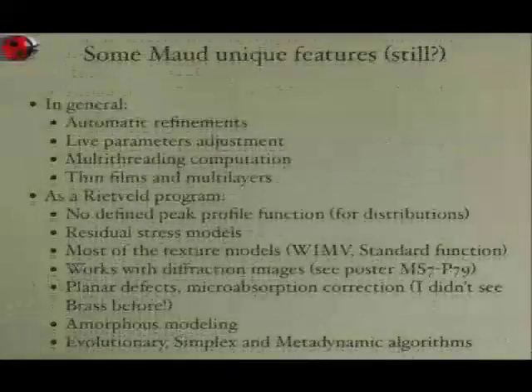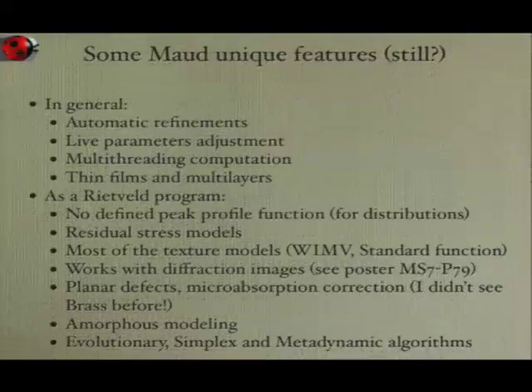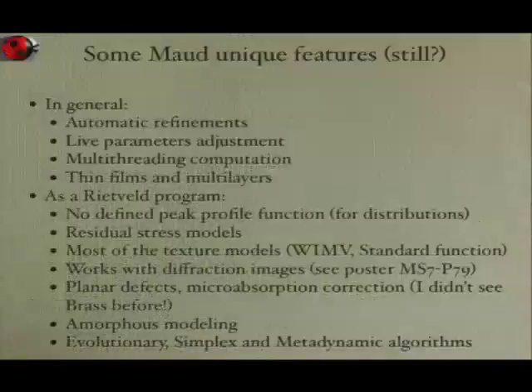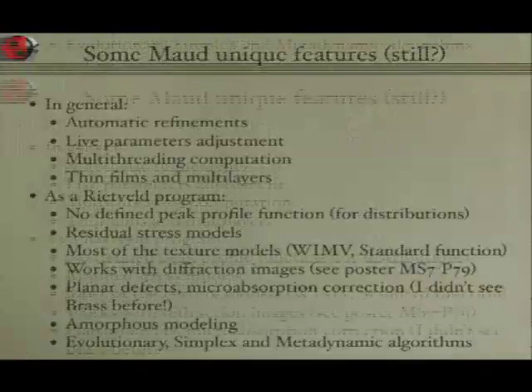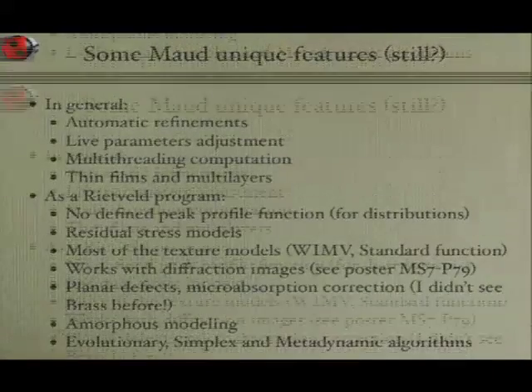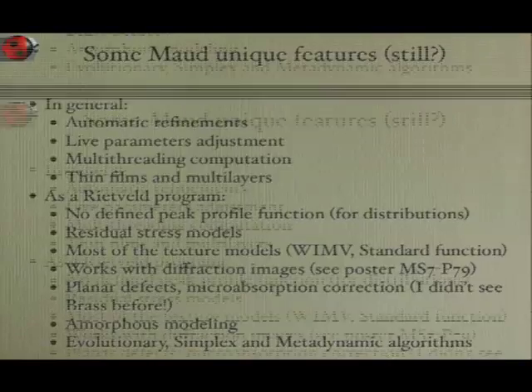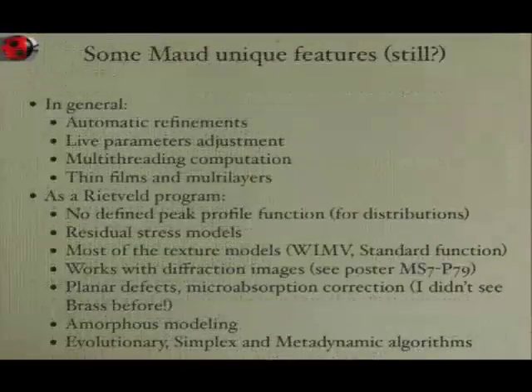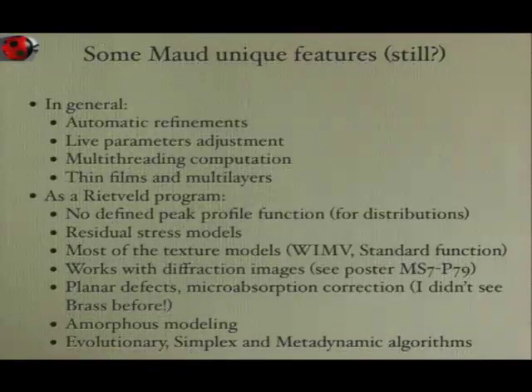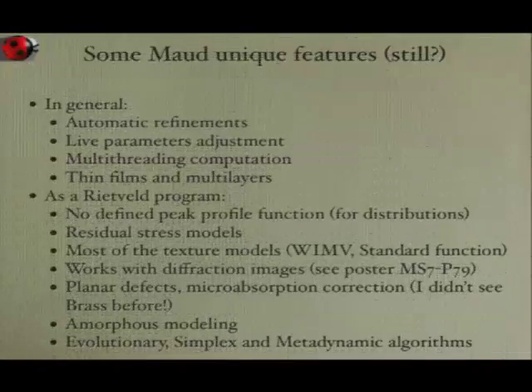Well, this one I prepared, not obviously yesterday, not even this morning. Automatic refinement was something in MAUD, but I think there are several programs, for sure Topas, but also others, that can do, let's say, an expert way in which you have to care less. Normally, if I have a simple analysis, I do the automatic analysis, okay? If it doesn't go, then I go through a more customized one. But if it goes, I get the result without any effort.